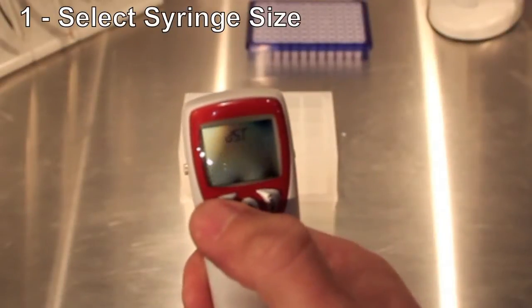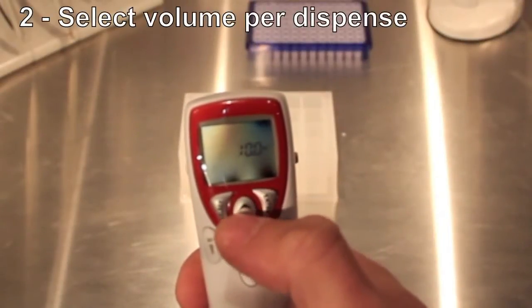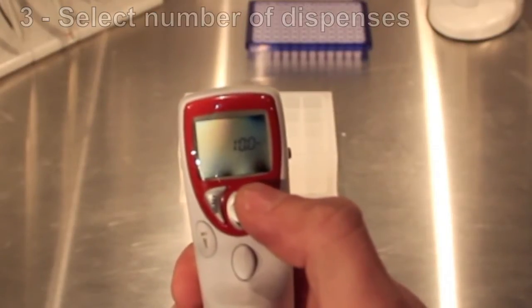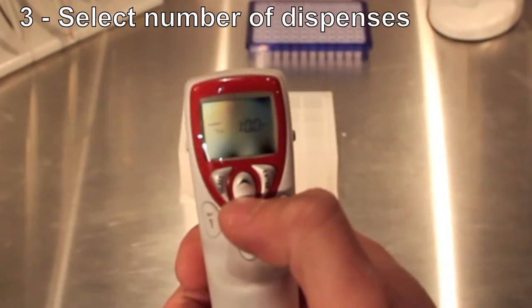The unit is very easy to program. You simply select the syringe size, select the volume per dispense that you want to use, and select the number of dispenses.